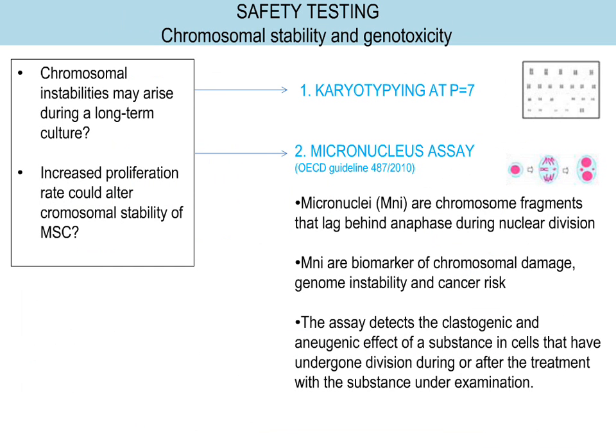Micronuclei are chromosome fragments that lag behind at anaphase during nuclear division. Micronuclei are biomarkers of chromosomal damage, genome instability, and cancer risk. The assay detects the clastogenic and aneugenic effect of substances in cells that have undergone division during or after the treatment with the substance under examination.